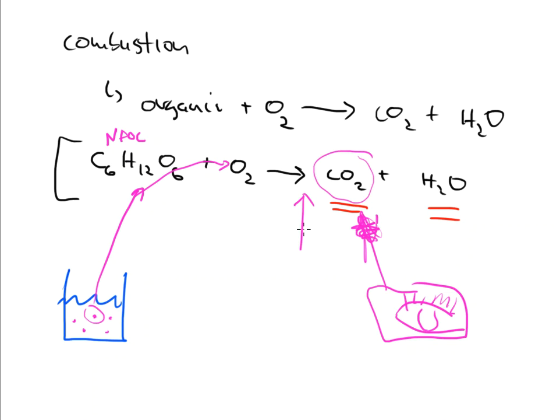If I have a lot of CO2 here, I'm going to have a lot of NPOC here. That's what makes the CO2, folks. Of course, if I do not have a lot of CO2, then that means my sample probably does not have any or very few non-purgeable organic carbon molecules. So overall, this is the TOC, and that is a combustion reaction. An organic mixed with oxygen gives me CO2 and water.